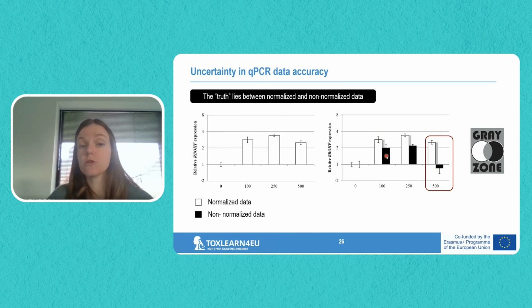So you can say with certainty that the expression is increased, but the actual number of the increase could differ. So it's either 3 or 2 or any value in between. So that's sort of our uncertain or gray zone. And because we call this zone the gray zone, the algorithm is called GrayNorm. So normalization based on this gray zone.